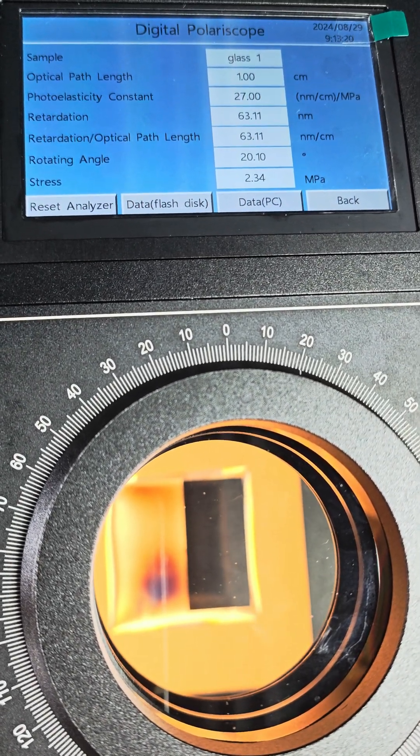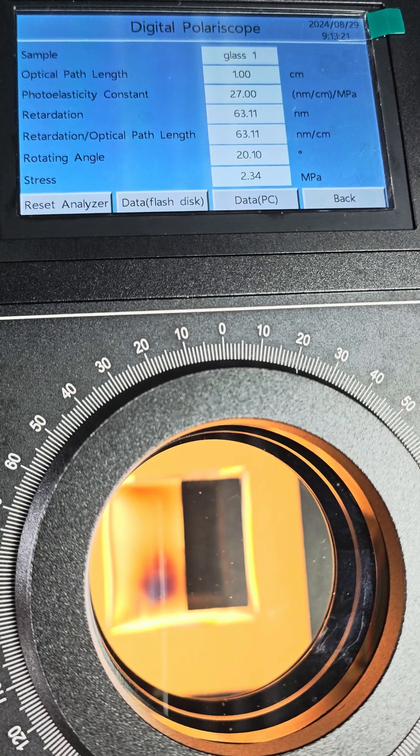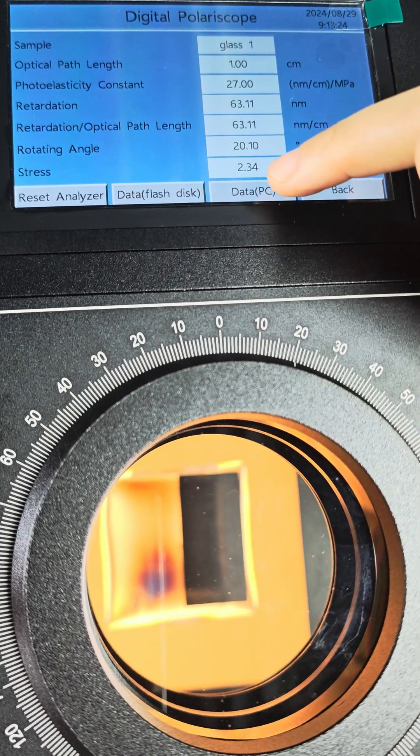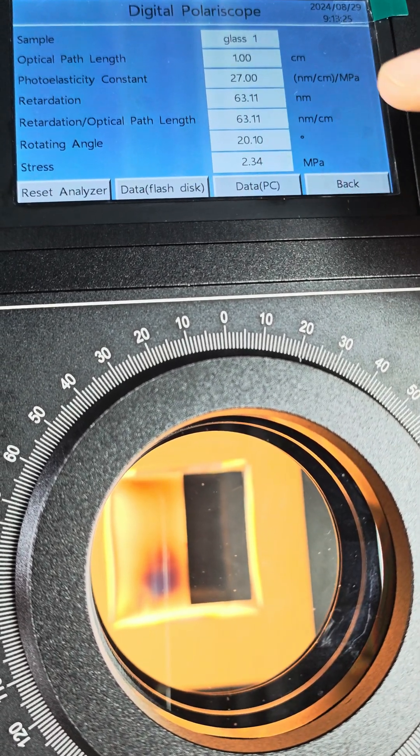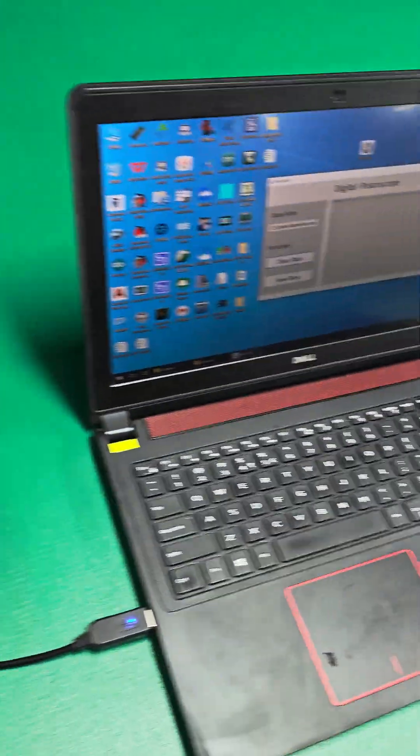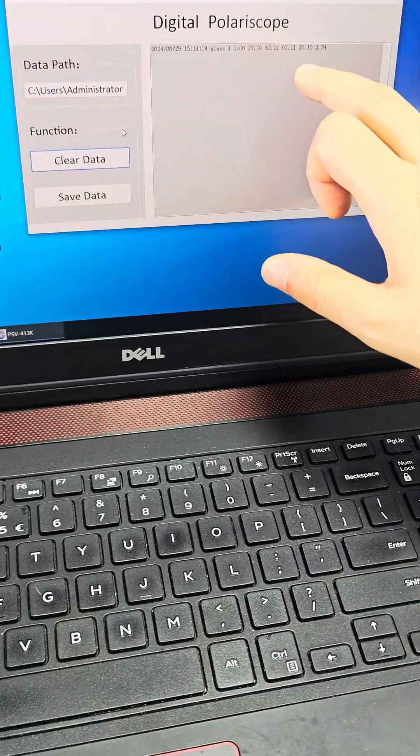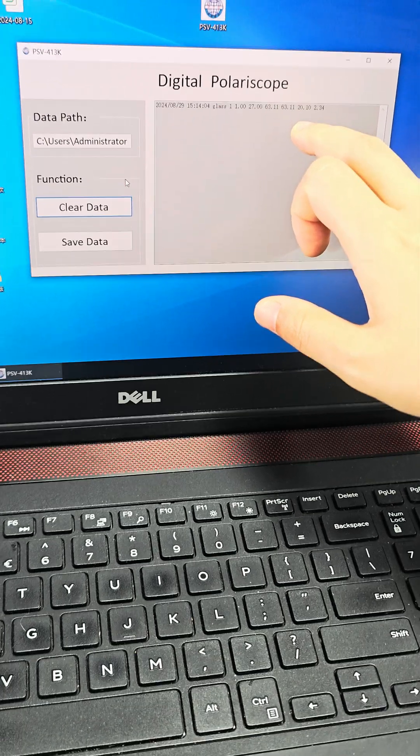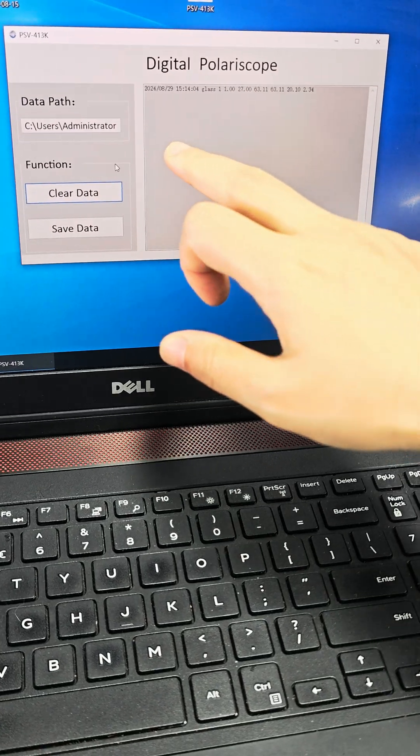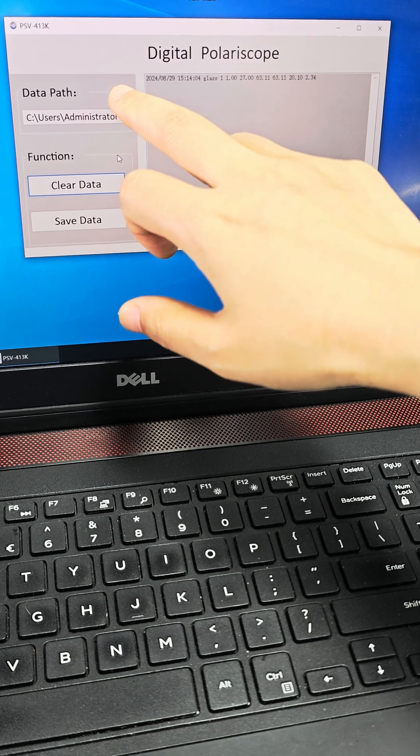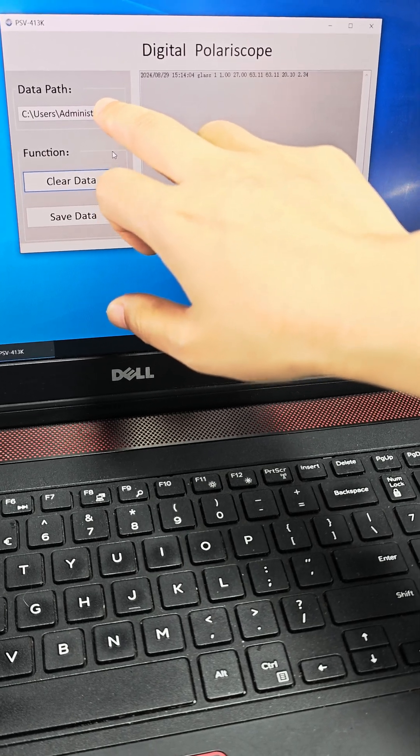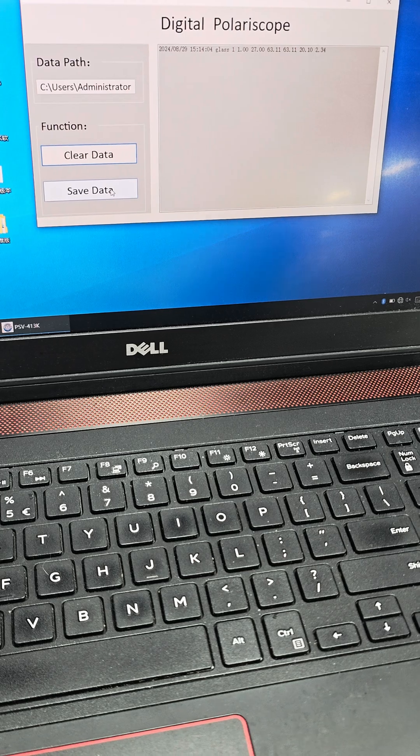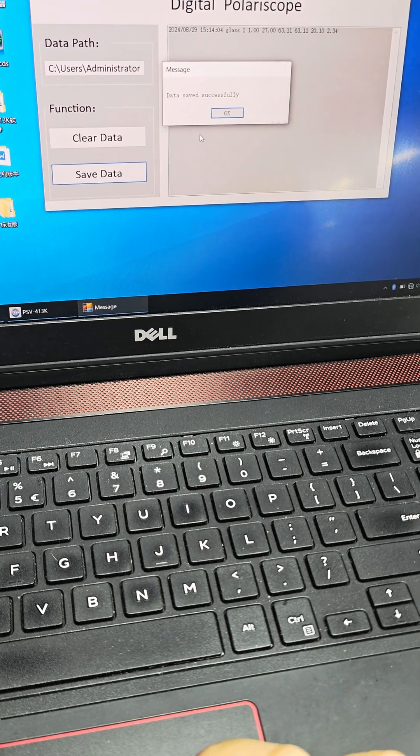If we want to save the data into a computer, press the button data PC. Then the measured data will be displayed on the software here. We need to select a data saving path, then click save data to confirm.